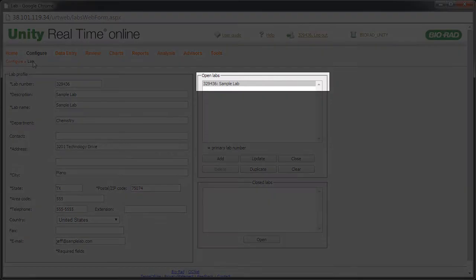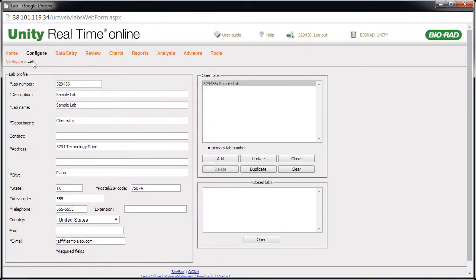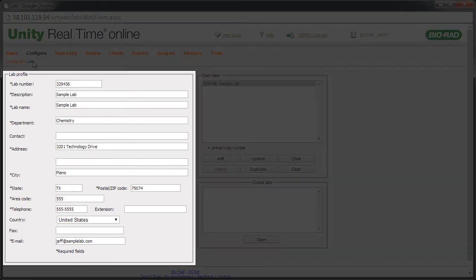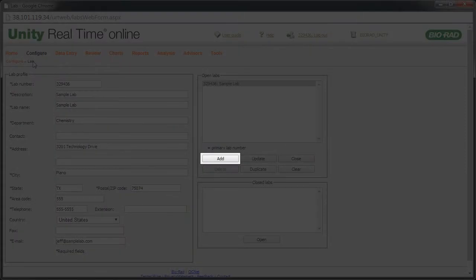Each lab is assigned a primary lab number by Biorad. Additional lab numbers for like instruments are available upon request. To set up a lab, type the lab number provided by Biorad, as well as the required information. Then click Add.